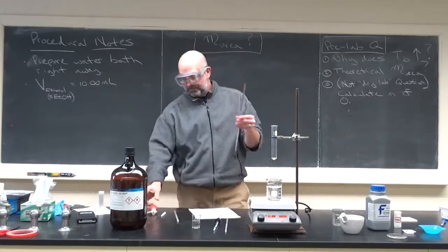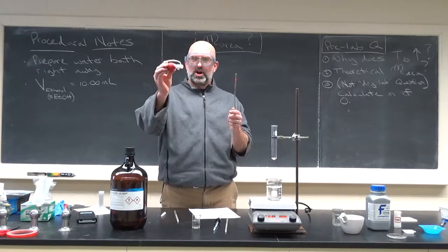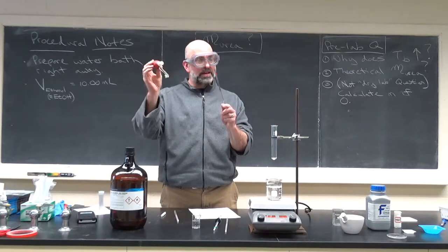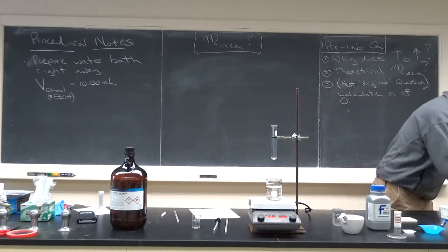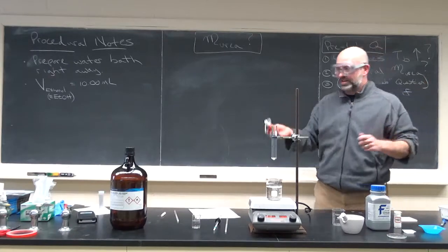So you have the pipette, and your instructor, again, may have slight differences here. You want the pipette bulb. Check the pipette bulb to make sure there isn't any liquid up in the bulb that you are unaware of because you can't see it. You can always come over to the sink and if it sprays a bunch of liquid out, then you want to take it apart, clean it, dry it, or just get another one.